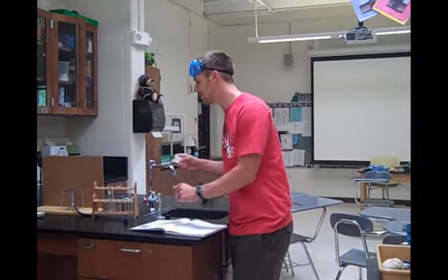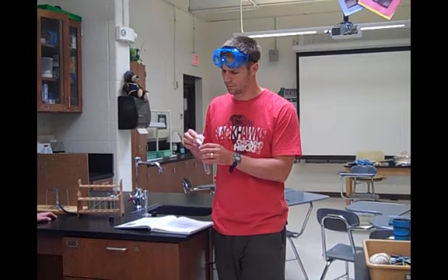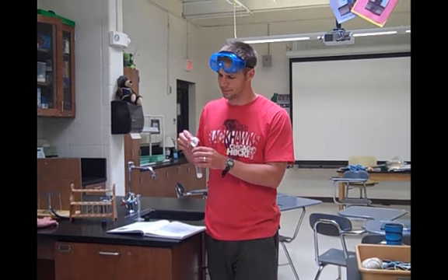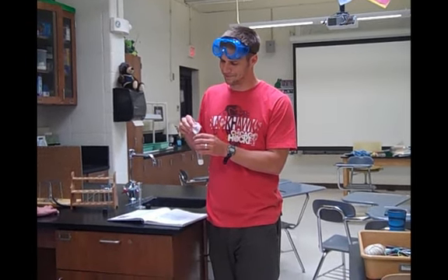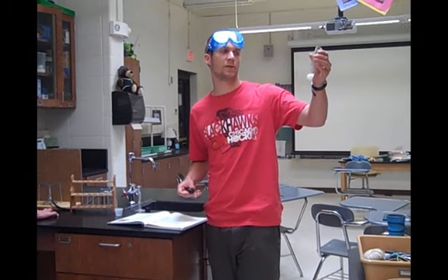Once you have your 5 grams of your unknown substance, you're going to take that and put it in your large test tube with your 5 milliliters of water.